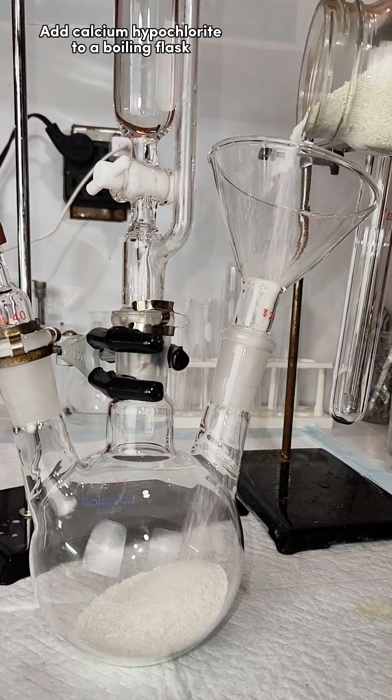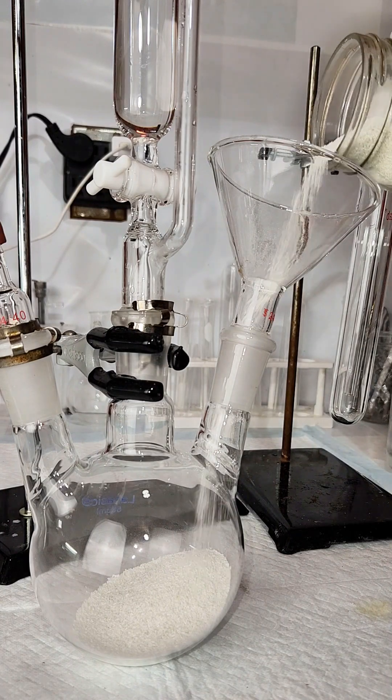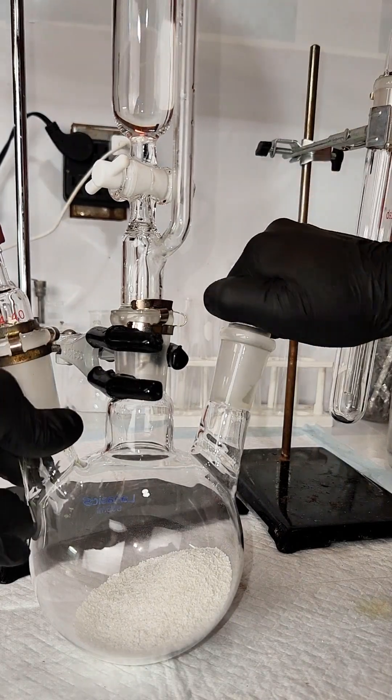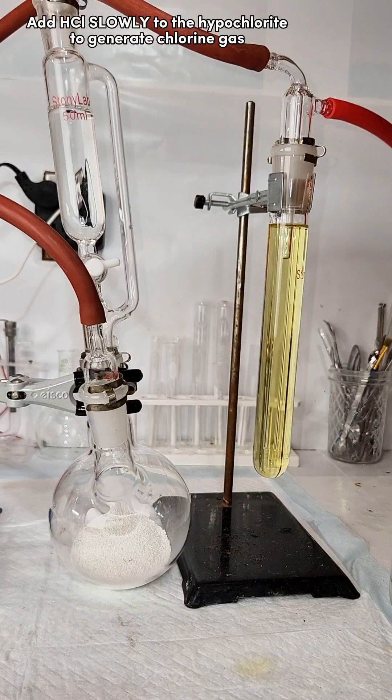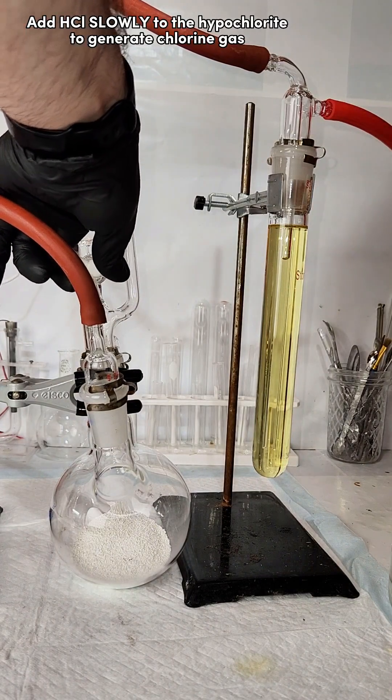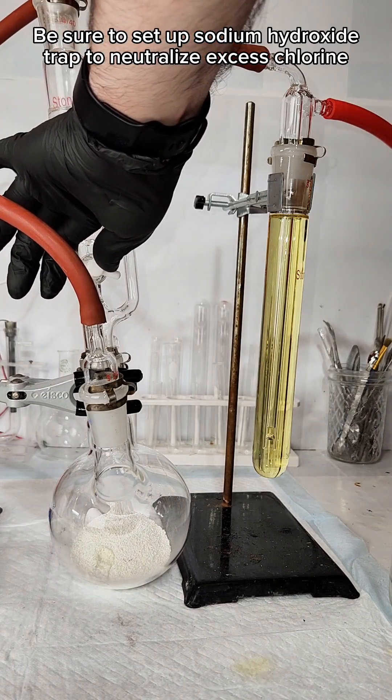To generate my chlorine gas, I add some calcium hypochlorite pool shock to a three-neck boiling flask and stopper it. I then set up an addition funnel filled with concentrated hydrochloric acid, which will be slowly dripped into the calcium hypochlorite. The two chemicals will immediately and exothermically react to form chlorine gas and calcium chloride.